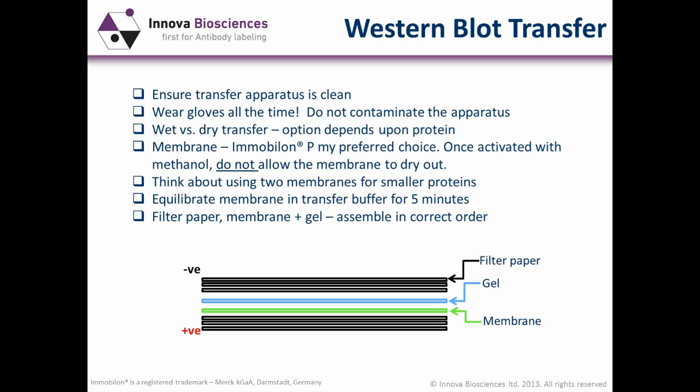I've had this situation where I've ended up with a blot which is blotchy, and generally that's been a result of residual protein being left over from previous transfers, and sure enough, it's contaminated my membrane when I was probing it.